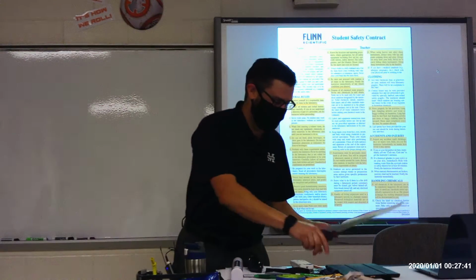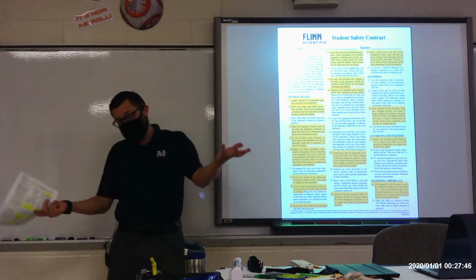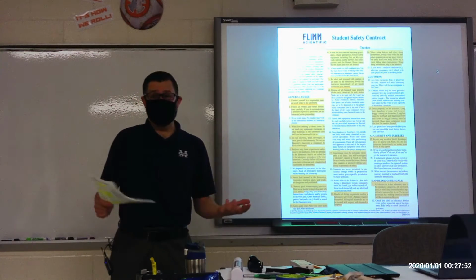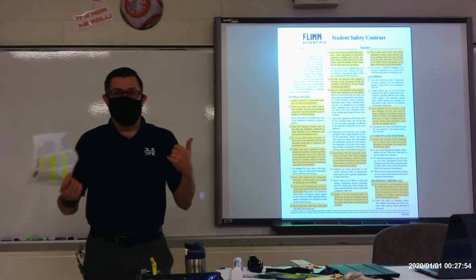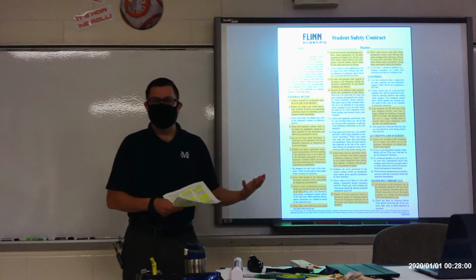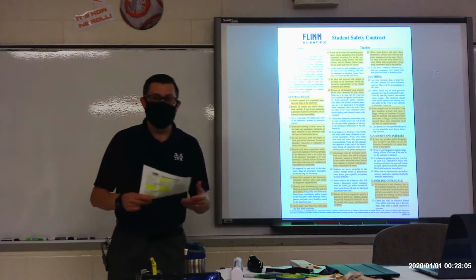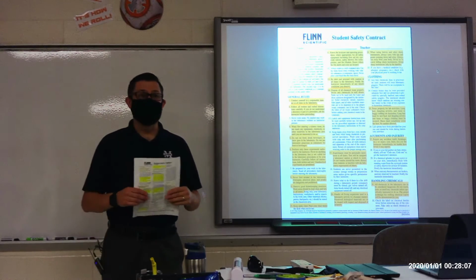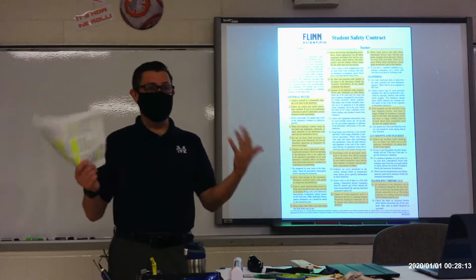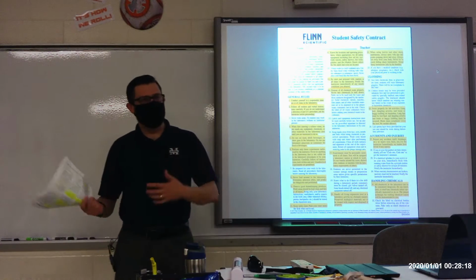And I can tell you, as a biology teacher, we use scalpels because we're doing dissections, and I've had some teachers say to me, you're crazy giving a bunch of teenagers scalpels. The thing about it is a scalpel is just a tool. And if we're going to do something like a dissection, we need the proper tools. And it's me giving you a great deal of responsibility, but if you can show me that you are responsible enough, then we will do those activities. If you show me, hey, I can't handle it because I'm too immature, then we'll find other things to do with our time.